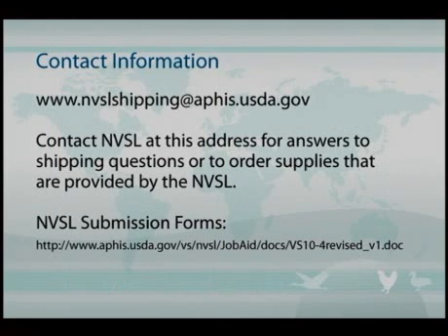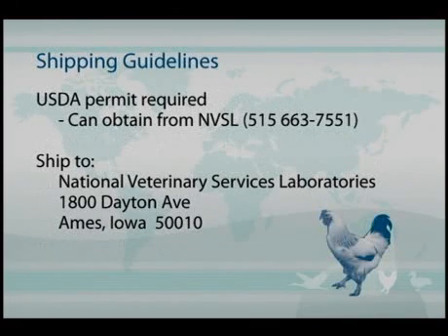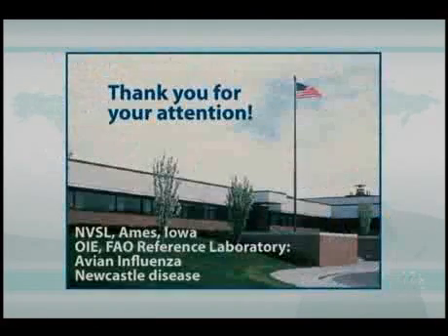This is also the contact information for NVSL should you wish to send samples to us for characterization. If you're going to send samples here, we do ask that you need a USDA permit, and you will have to call us to get that, and we will fax that permit to you, and we'll have instructions that go with that permit for shipping samples to the NVSL. Here's the address to ship to our lab.